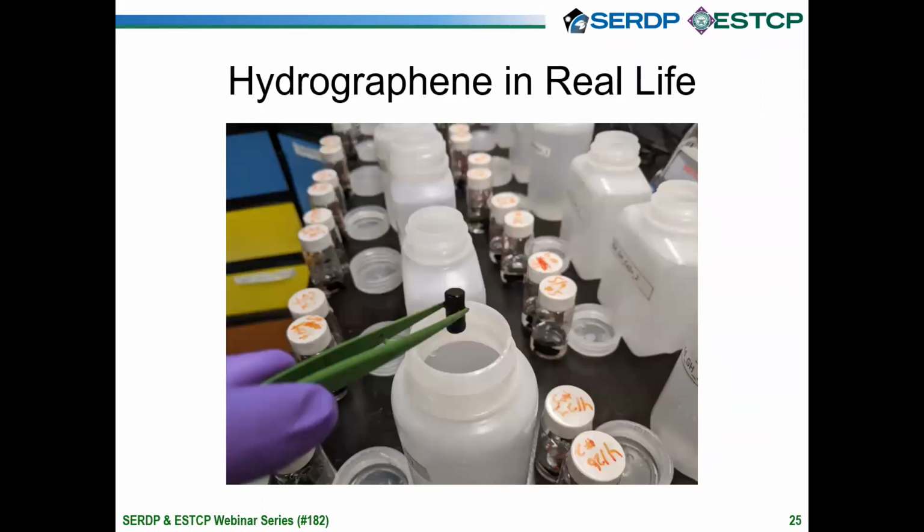And you can see it here in action. You can see a pin set, you see the remnants of two fingers. So it's a fairly small device. And here we do a series of lab experiments. And when I say we, it's mostly Dr. Jitka Becanova, who has been leading this effort for us.